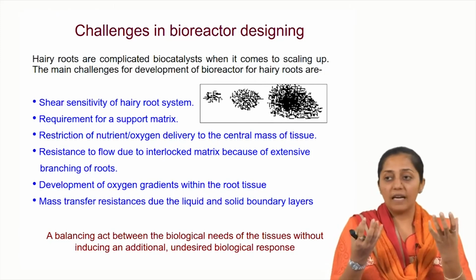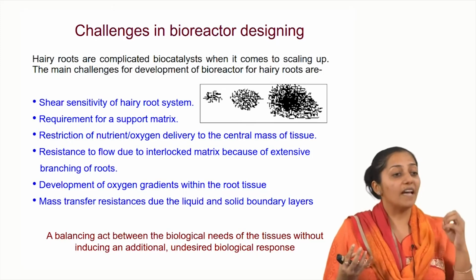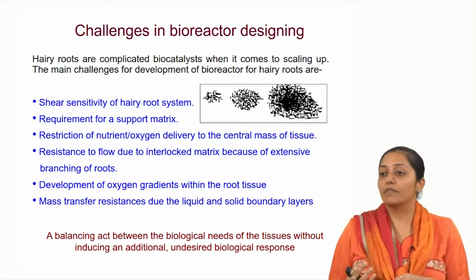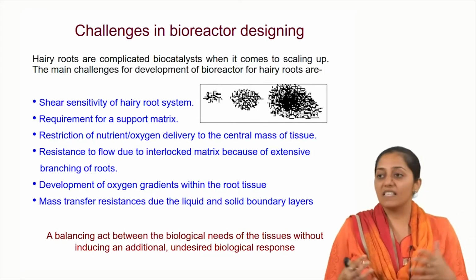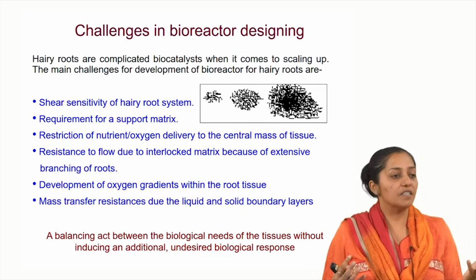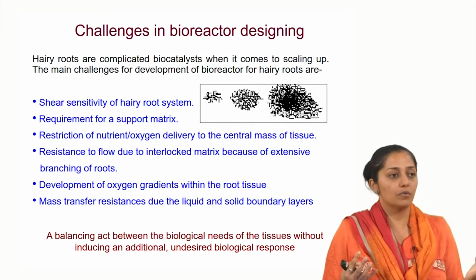So we had seen a complete difference in the morphology, because by adding gibberellic acid what we observed was that there were n number of meristems which came out. So more number of meristems, heavy branching; gibberellic acid is known to increase branching in root systems.